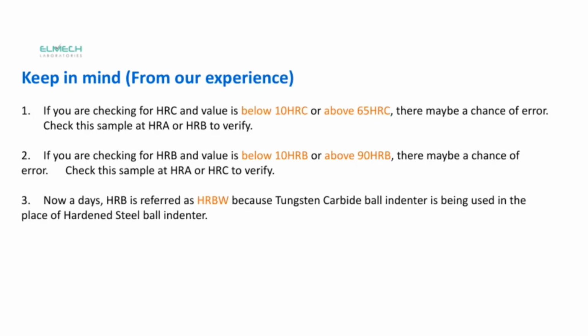Let's keep in mind a few things from our experience. First, when you're checking for HRC, if the value is below 10 HRC or above 65 HRC, there's a good chance of error. So, it's always a good idea to verify that sample at HRA or HRB to ensure accuracy.